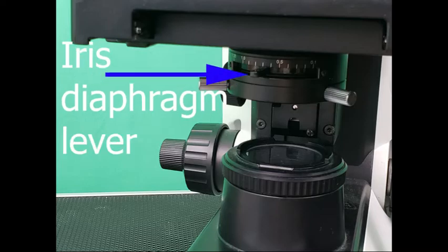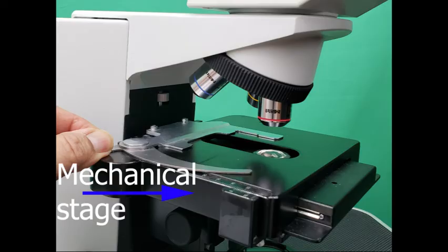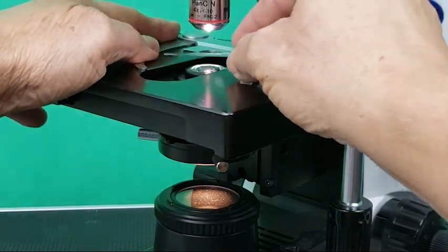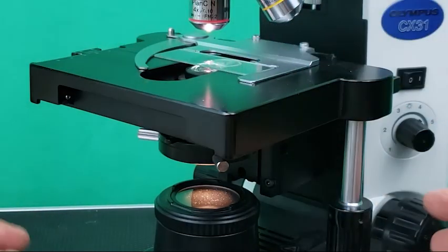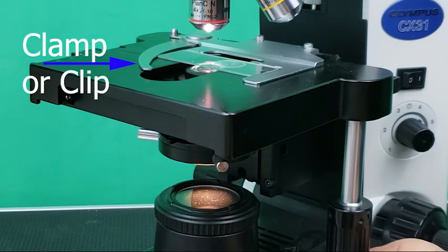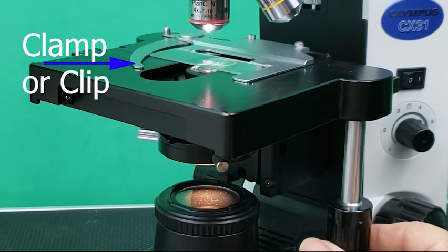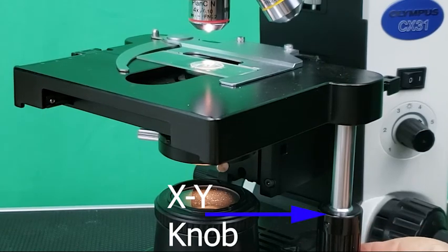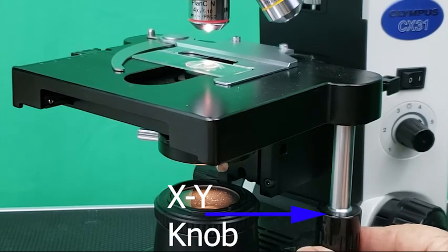The stage, sometimes called the mechanical stage, is a flat platform beneath the objective lens upon which the slide is placed. The stage has either a mechanical stage clamp or clip, both of which keep the slide stationary during viewing. The mechanical stage adjuster knobs allow the precise movement of the slide on the stage.